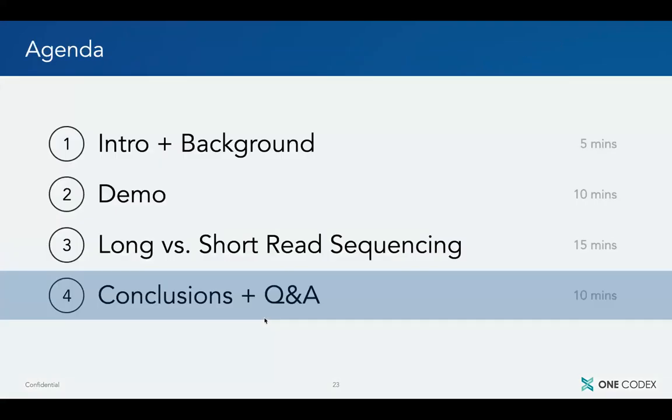So, we've walked through looking at short read 16S V3, V4 sequencing, short read shotgun or whole genome sequencing, and LoopSeq 16S sequencing across the ATCC microbiome standards as well as the Zymo Biomics microbial controls. And these are both known community mixtures, and we've used those to benchmark and understand how accurately do these various technologies recapitulate what we observe, for the purposes of thinking about, approximating and measuring a stool sample or a saliva sample or some other human microbiome or environmental metagenomic sample.